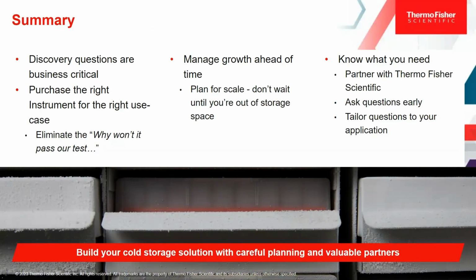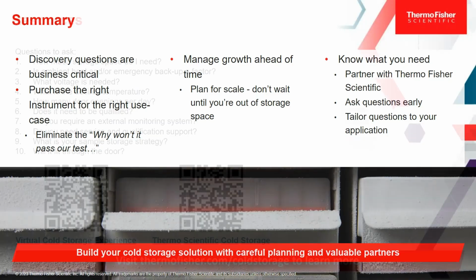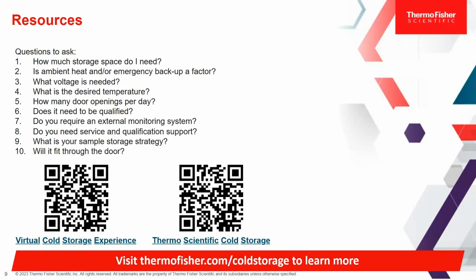So that's it for our 10 tips. Think about it from the beginning. These questions that we've presented are pretty important when it comes to what your end goals are. And then we want to make sure that you can get up and running as quickly as possible and have success throughout the entire process, so that you don't have to think about your cold storage. You just grab your samples, grab your products, know that they're going to be kept at the right temperature, know that they're going to be easy to access, so that you can go and focus on your protocols and your science.